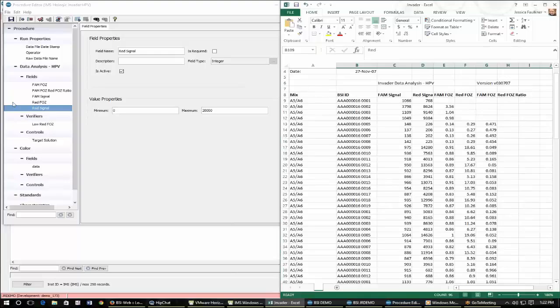So we first set up our data tables. I have my first table here at the top, which is just your traditional table where each row can contain multiple pieces of information for one individual specimen or iteration of a specimen.